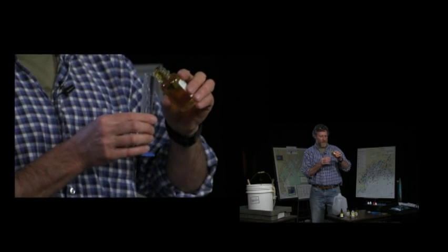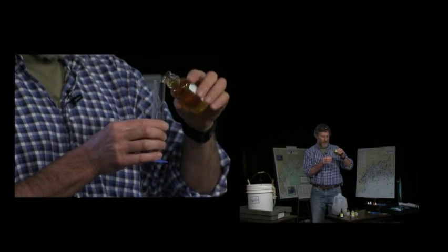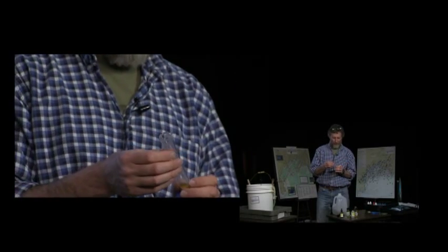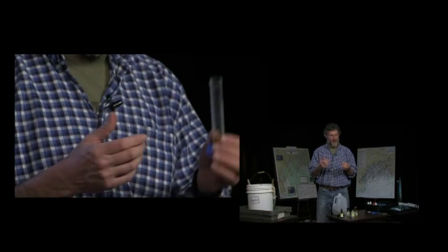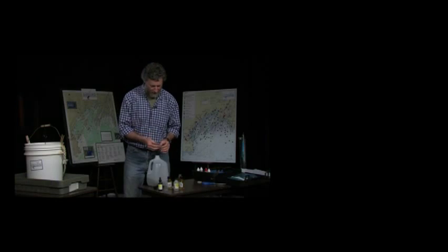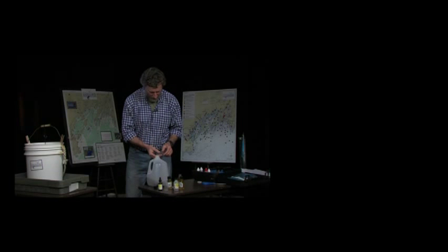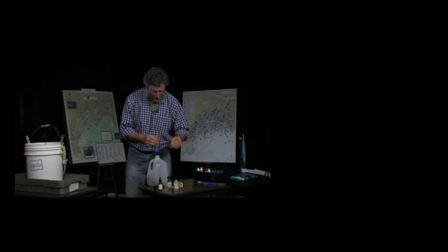We're going to pour off a little bit into here because, as we did with our white bucket when we collected the sample, we rinsed it 3 times. Well, we want to rinse this 3 times as well because it may have residue from a previous sample. So we're going to give that a little bit of a rinse, 3 times.